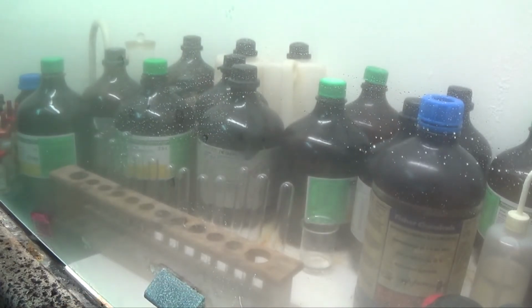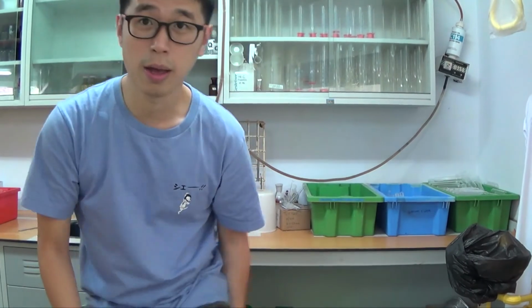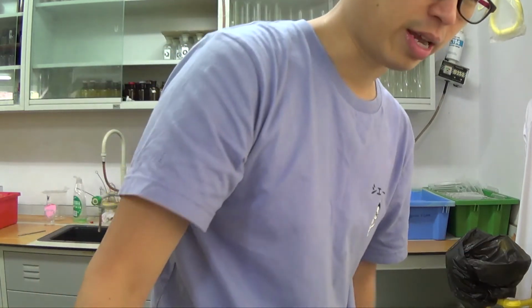So that is not a good idea. Oh gosh, the fume hood's ventilator is not working. In a proper fume hood it would be fine, but the smell of ammonia is really overpowering. If you ever smell ammonia, think of this as something like 20 times more concentrated, I guess. I'll try to get this done as soon as possible so that I don't have to bear with the smell that long.